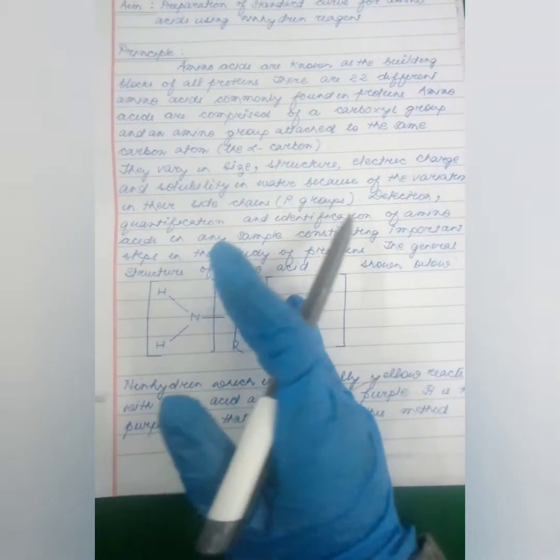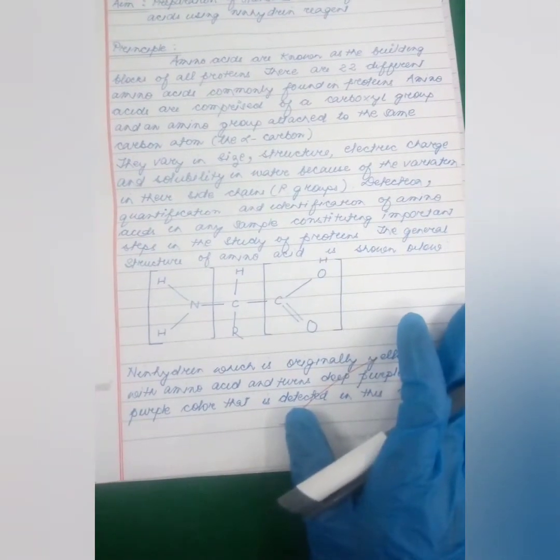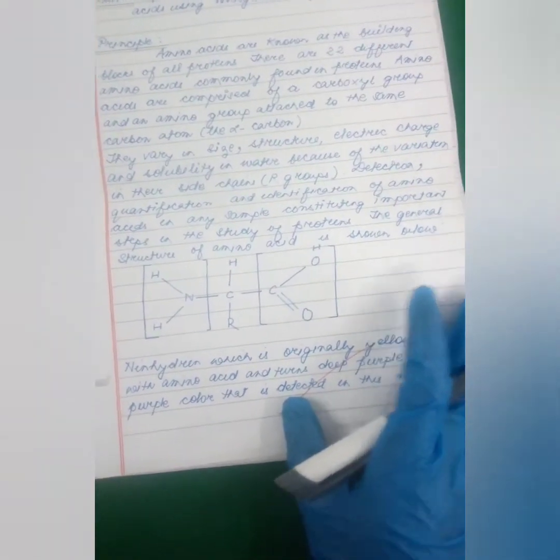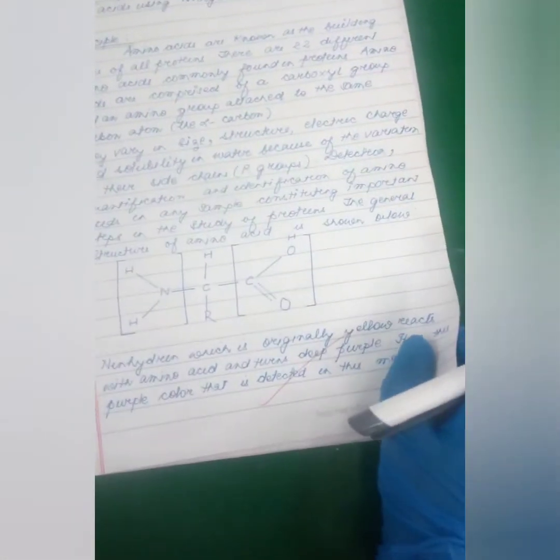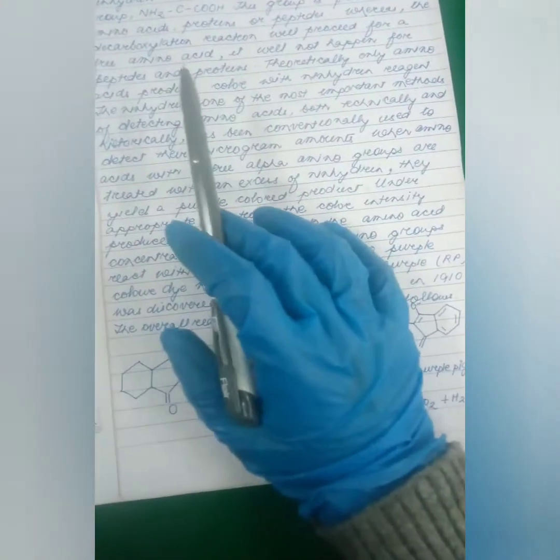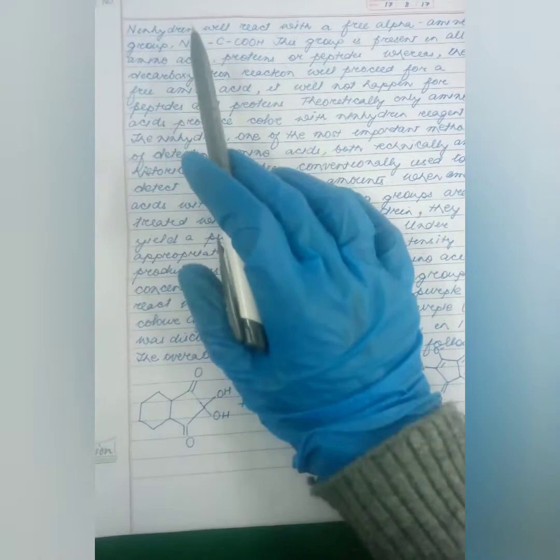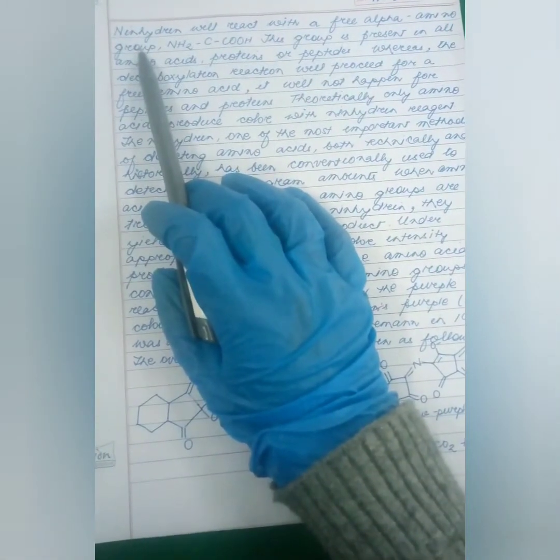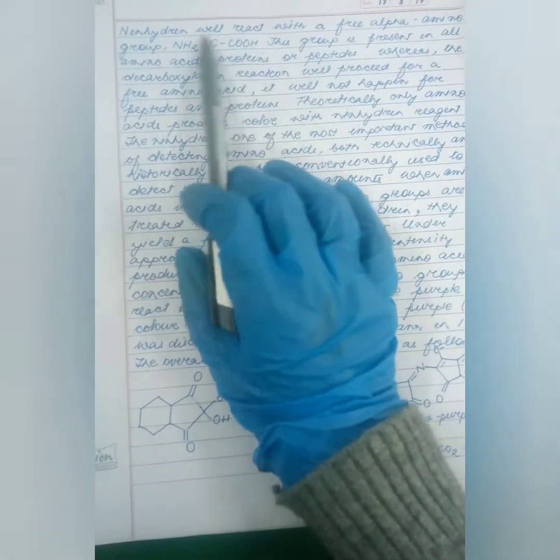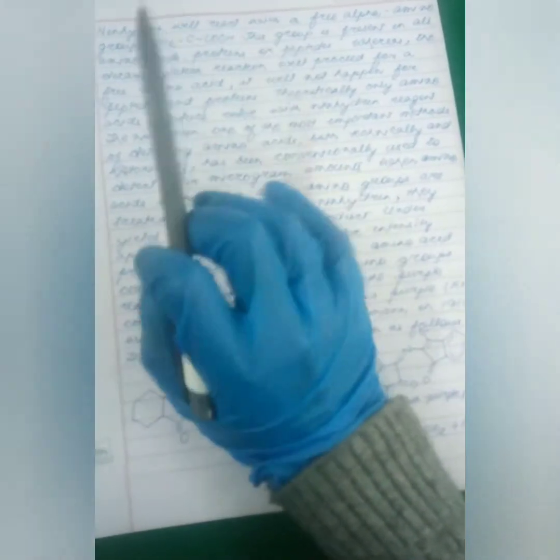Ninhydrin usually reacts with the free amino group of the amino acid, but not with proteins or peptides, only with free amino acids. Here we see a free alpha amino group, which is present in all amino acids, proteins or peptides.